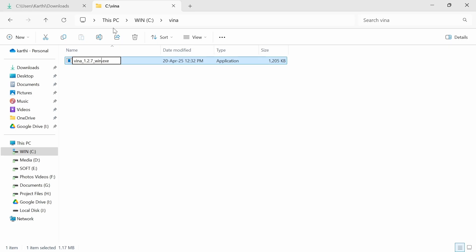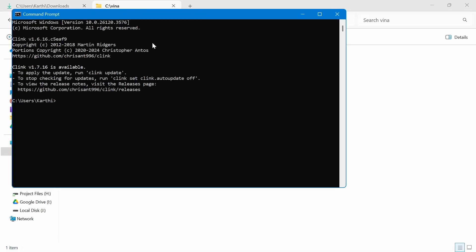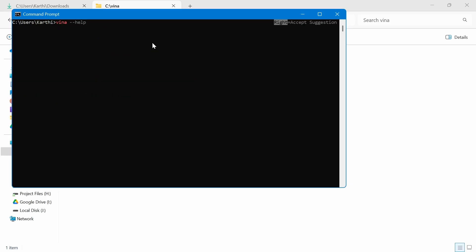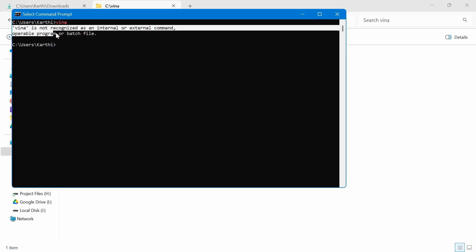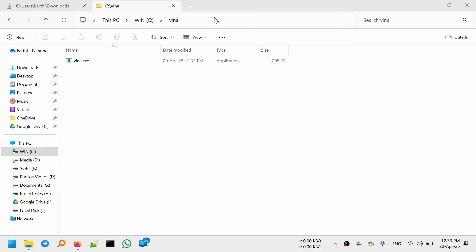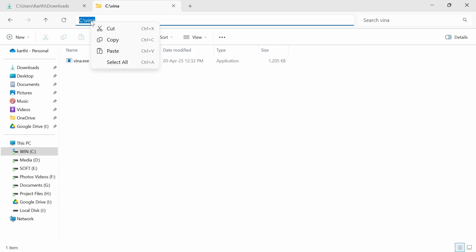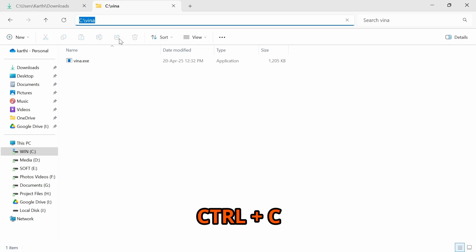Now you can rename this file. Rename it to vina.exe. Vina is not recognized as an internal or external command, so we have to add this path to the environment variables. Copy the path, which is C:\Vina.